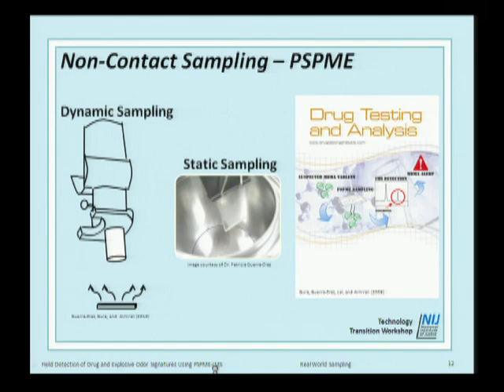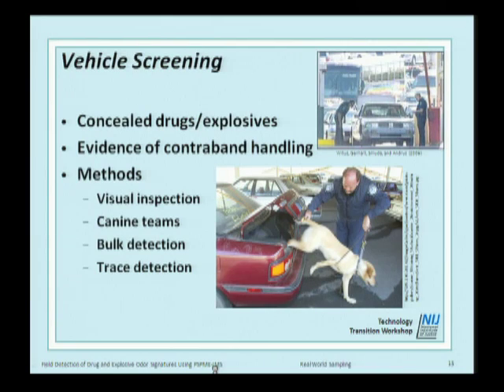So non-contact sampling can also be achieved by SPME. We have either the dynamic sampling mode or the static sampling mode, as you experienced yesterday. And again, as Dr. Almral said yesterday, we made the cover of Drug Testing and Analysis showing our methodology for using SPME IMS.